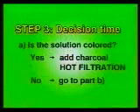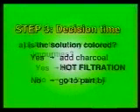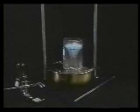Now that the solid is dissolved, you must make a decision. Do you expect a colorless product, but your solution is highly colored? If so, you need to add a small portion of decolorizing charcoal and do a hot filtration. Does it contain a few insoluble particles other than boiling stones? If so, the next step is a hot filtration. Recall that for a hot filtration to be effective, everything you use must be hot to prevent crystallization in the filter funnel.